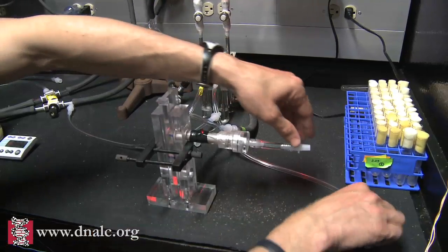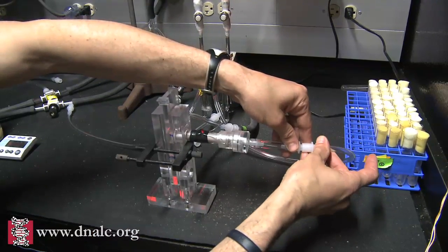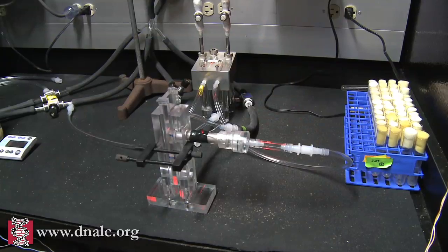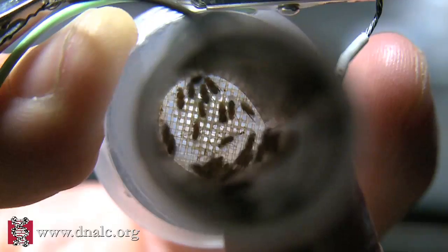After they feel the electric shock while smelling OCT, we give them a second odor, MCH, which smells a little bit like sweaty socks. While they're smelling MCH, there's no shock.